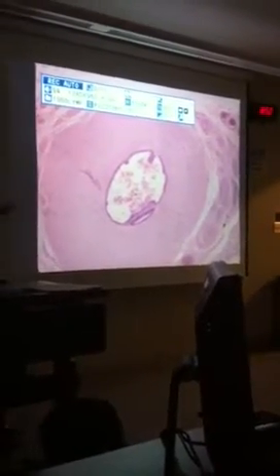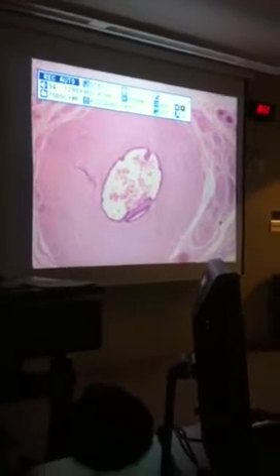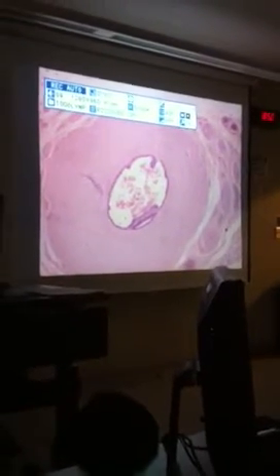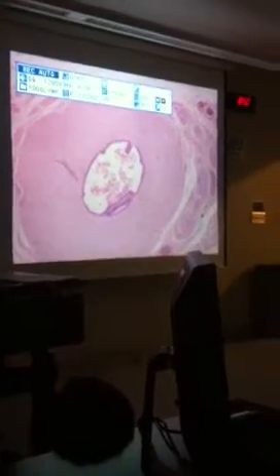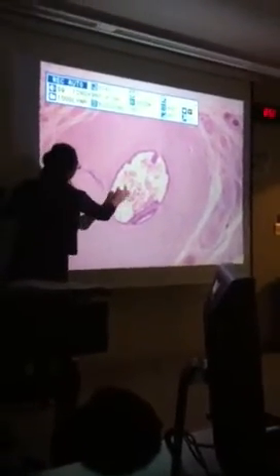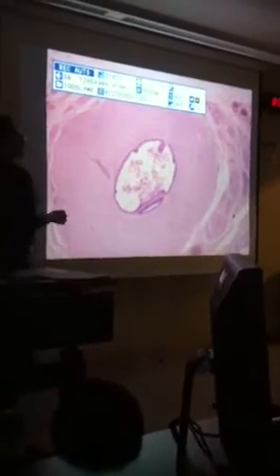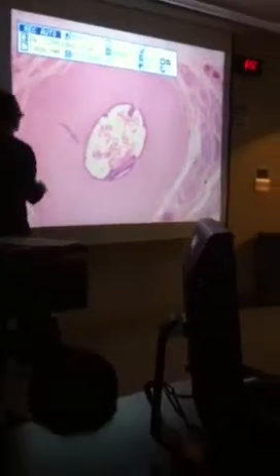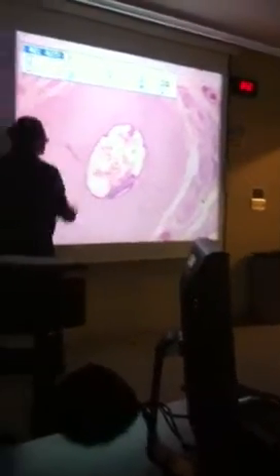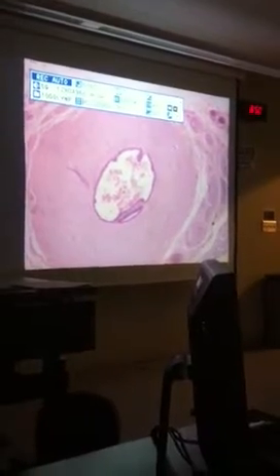It just depends on that particular organism, what was going on with the sperm cells at that particular point in time. So that one you can see, huge layer of smooth muscle, very circular, lined with simple columnar epithelia or pseudostratified, 1 and 2. See some sperm cells in there, but again, you don't necessarily have to see sperm cells.